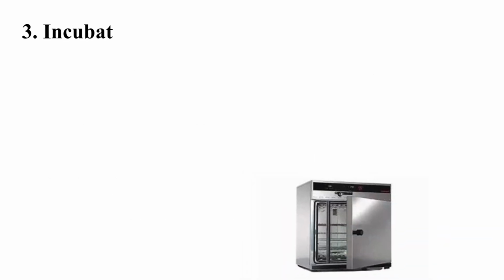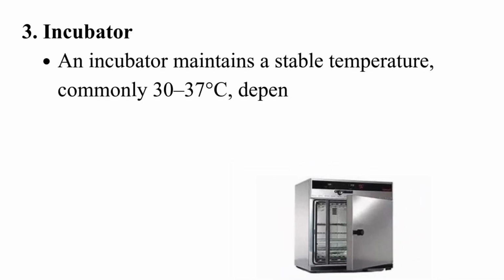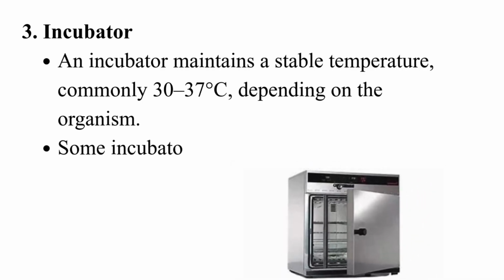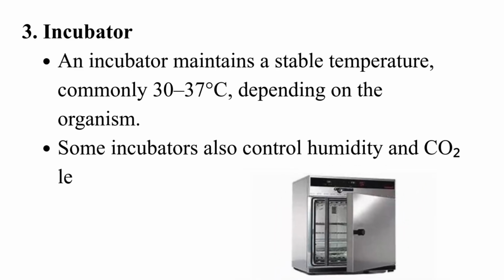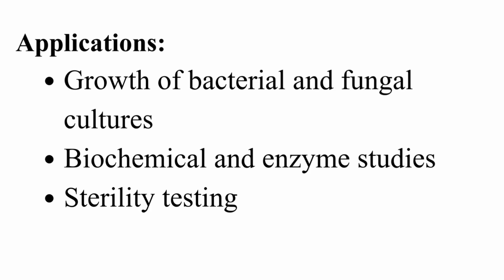Incubator. An incubator maintains a stable temperature, commonly 30 to 37 degrees Celsius, depending on the organism. Some incubators also control humidity and CO2 levels. Applications: growth of bacterial and fungal cultures, biochemical and enzyme studies, sterility testing.